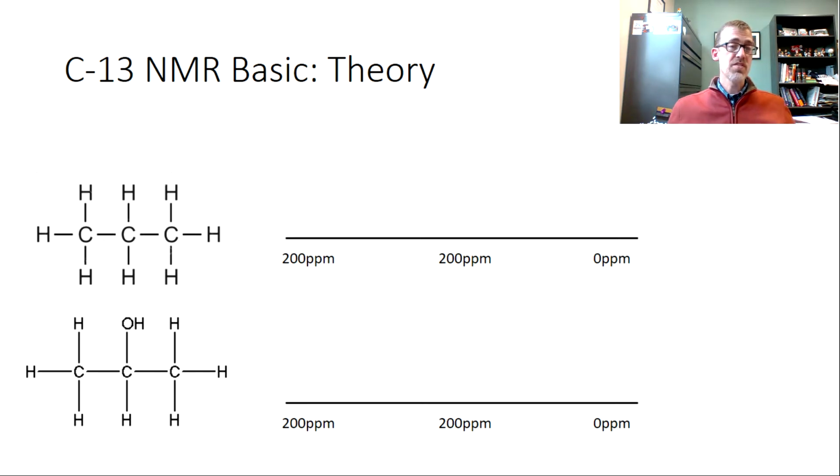We can use NMR to study other nuclei. NMR is the instrumentation that evolved eventually into the MRI, which is used for imaging for health reasons. And in those instruments, they're looking at hydrogen atoms and not carbon-13s. Basically what you'll see when you come to the lab is a fairly big magnet with a small hole. You have a small tube with our sample in it that will go into it. And if you were to go to an MRI lab, you'd see an enormous magnet with a big hole that you put a person inside. There's some sophistication, some added bells and whistles to make the MRI produce images, but the root technology is the same.